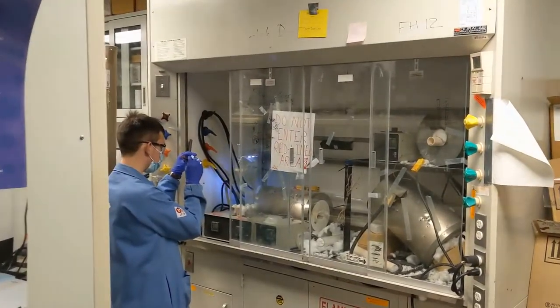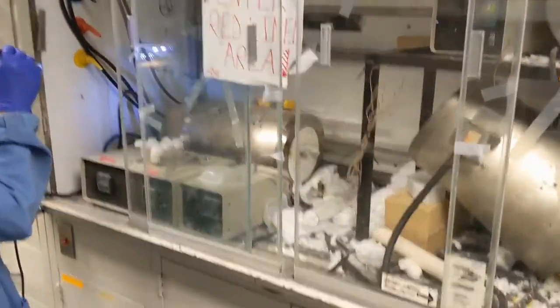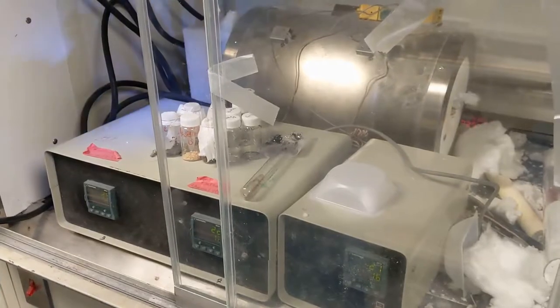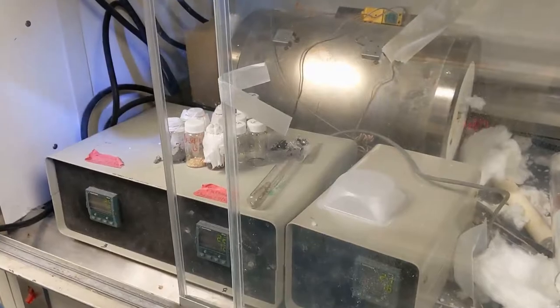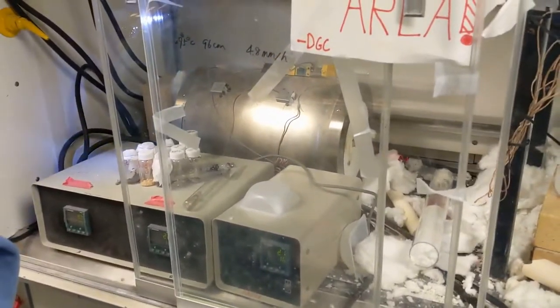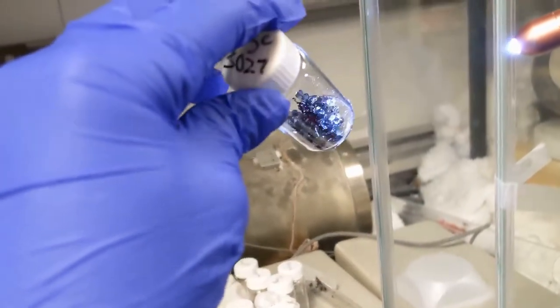In addition to all of our general-use furnaces, we also have more specialized and complicated ones. For example, here we have a two-zone furnace, which is especially important in our field of science where we use a lot of crystal growth and analyze crystal structures. The two-zone furnace is used for chemical vapor transport, which helps you grow better crystals. You can see here we've got some thoragous crystals that have been grown using CVT.